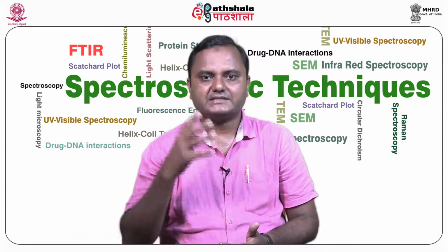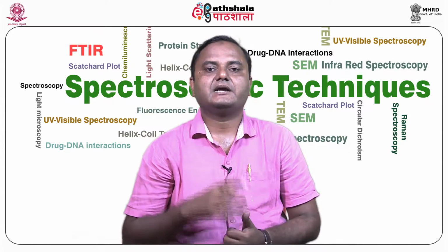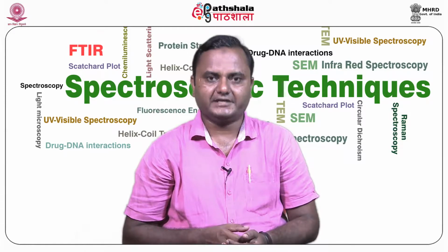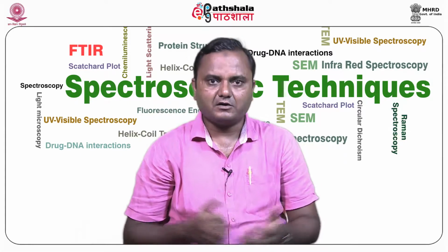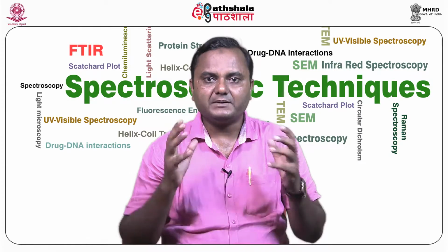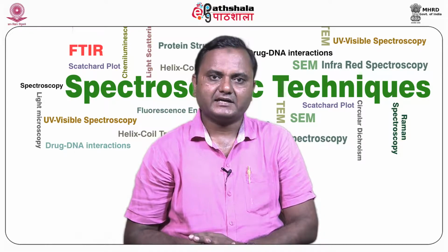By measuring the scattered light intensity for one molecule at various concentrations, the second virial coefficient A2 can be calculated. A spatial analysis technique such as the Zimm or Guinier plot can be used to obtain the optimum results from the measured data. Now, we talk about the basic principle of static light scattering.